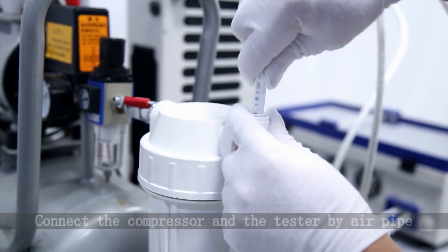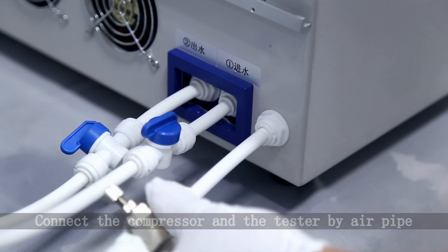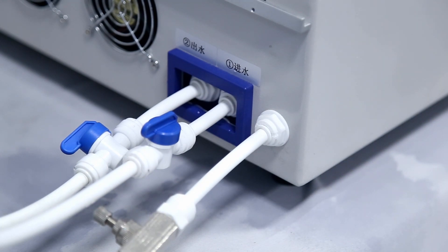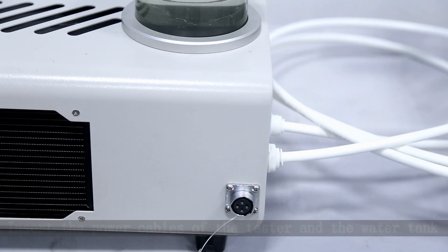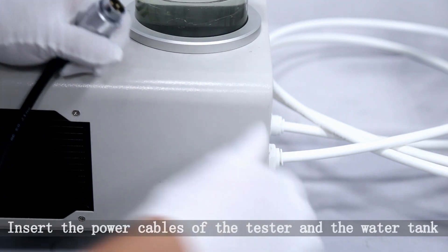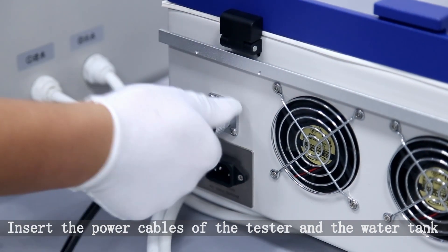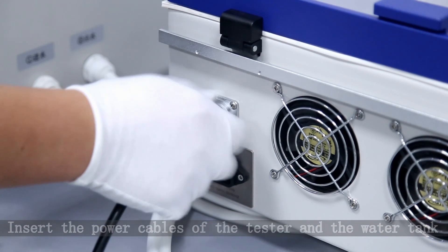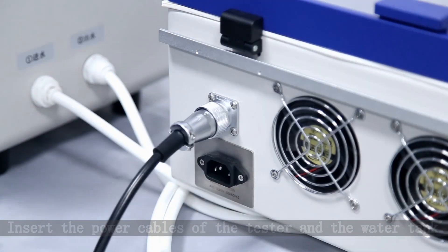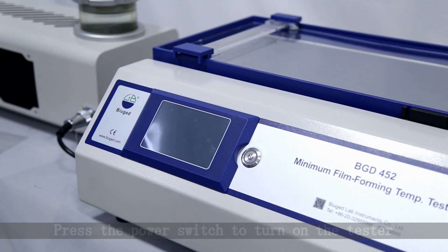Connect the compressor and the tester by air pipe. Insert the power cables of the tester and the water tank. Press the power switch to turn on the tester.